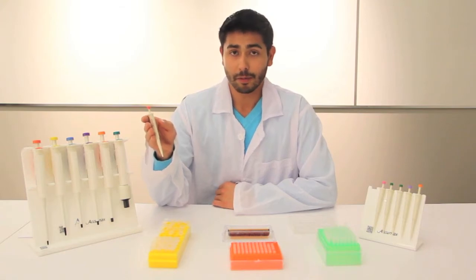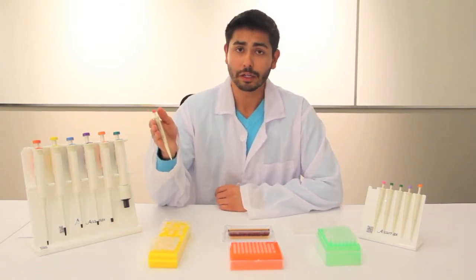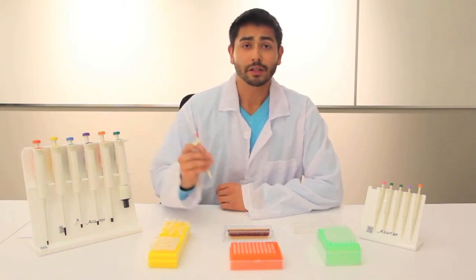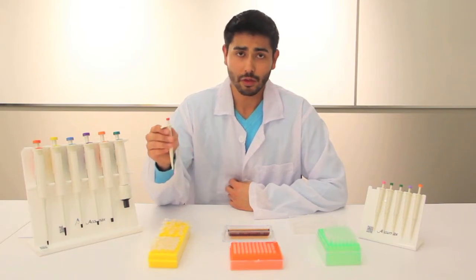What they're lacking that a normal pipette has is a tip ejector, so it's manual tip ejection — you just have to remove it with your hand. The AcuMax Juniors are also fully autoclavable, meaning you can just throw the whole thing in an autoclave and get it sterilized. The AcuMax Junior Pipettes also feature ISO 8655 certification, meaning they're calibrated under international standards, and they feature a three-month warranty.